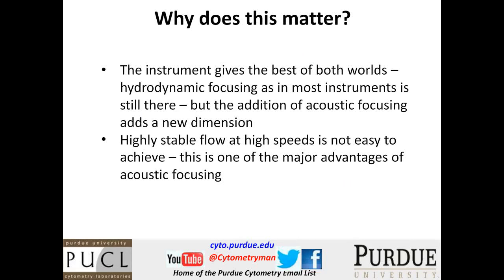So let me summarize a little bit here for what we've been discussing. Why does this matter? I always like to ask myself that question. Why does it matter? Why do I care? So the instrument gives best of both worlds, because we know that hydrodynamic focusing works well in most instruments that are out there.